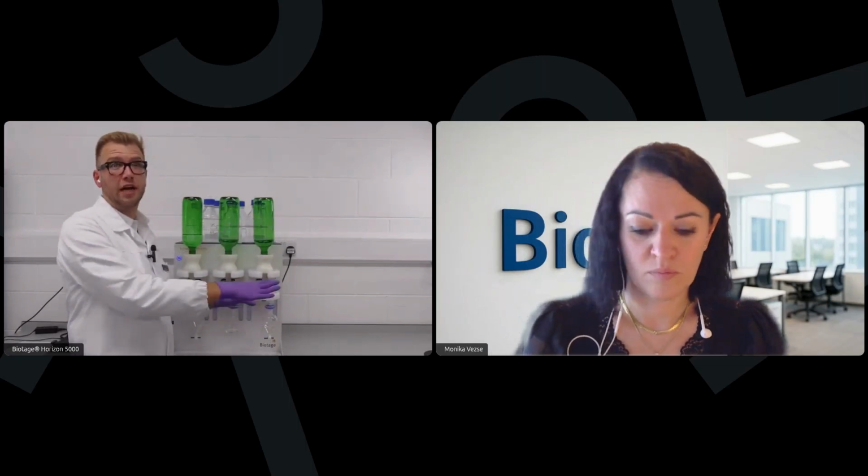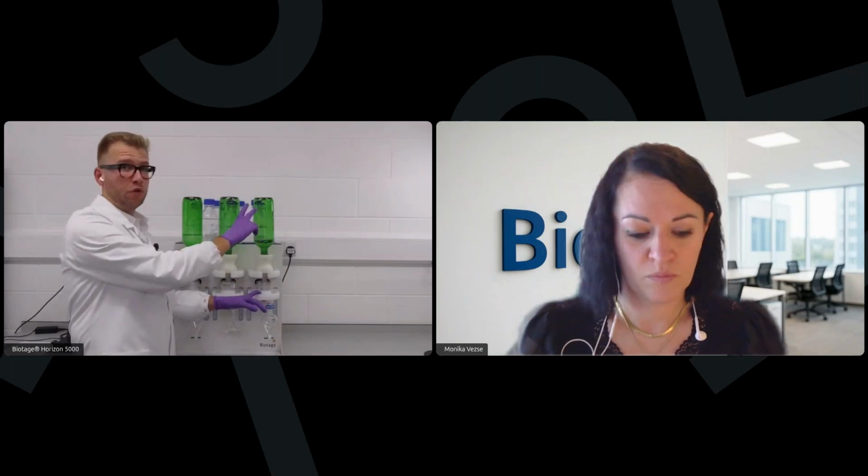On the same station, if you have a clogged disk, you remove the disk, and whatever is left in the disk holder, you pour into the original sample bottle. That position you carry on processing as is, so you essentially allow for elution, and then you process what's left in the original bottle on a new station. At the very end, you combine the two extracts, and you've not lost any sample.